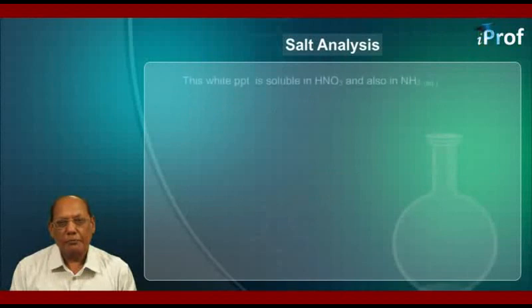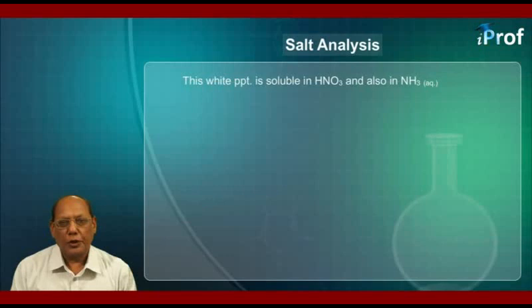This white precipitate is soluble in HNO₃ and also in aqueous ammonia.